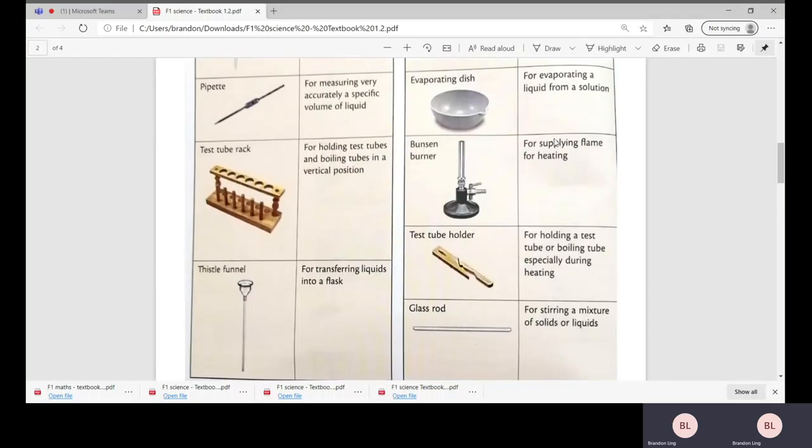Next we have the pipette for measuring very accurately a specific volume of liquid. Evaporating dish for evaporating a liquid from a solution. Next we have the test tube rack for holding test tubes and boiling tubes in a vertical position. Usually after the end of our experiment, we can actually put the test tube on this test tube rack.